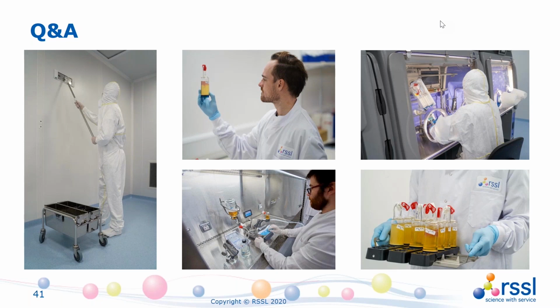Okay, thank you. So I have another question from Eleanor, who said disinfectants have been tested against fungi and bacteria, but within the pharmaceutical industry, we're seeing a lot more of these new gene therapy biopharmaceuticals coming through using viral vectors. And with very little virucidal disinfectants available, how do you monitor for viruses, or do you monitor for viruses? It's very, very difficult. There are disinfectant standards showing that you can put viruses onto surfaces, and if you have a disinfectant that claims to have virucidal properties, that you can eliminate it. But in terms of ongoing monitoring, that's incredibly difficult and time consuming to do.